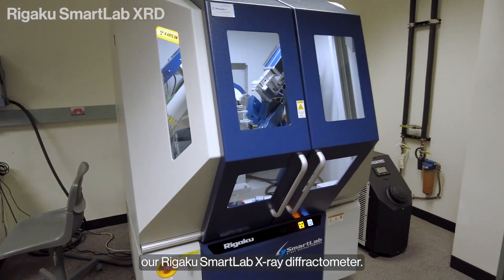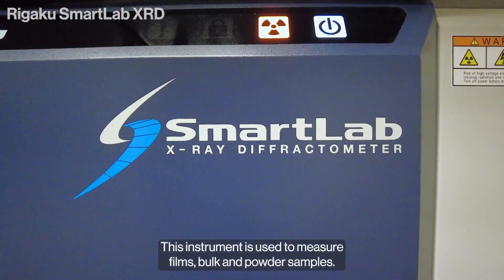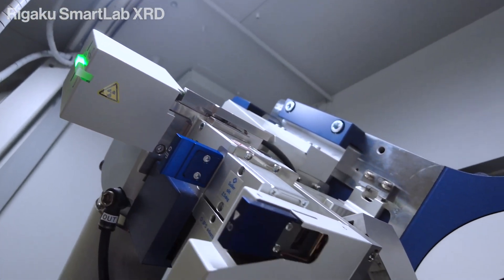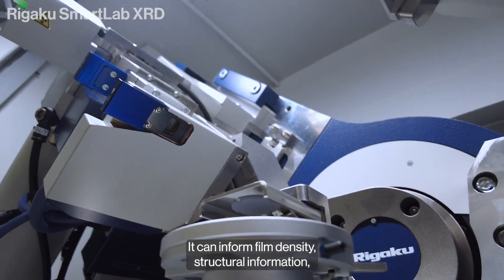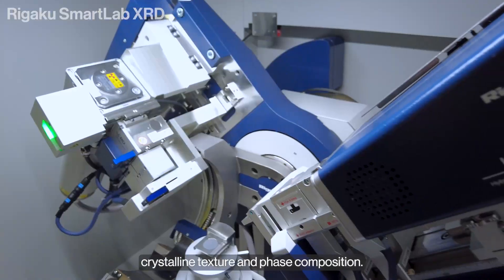This is our Rigaku SmartLab X-Ray Diffractometer. This instrument is used to measure films, bulk, and powder samples. It can inform film density, structural information, crystalline texture, and phase composition.